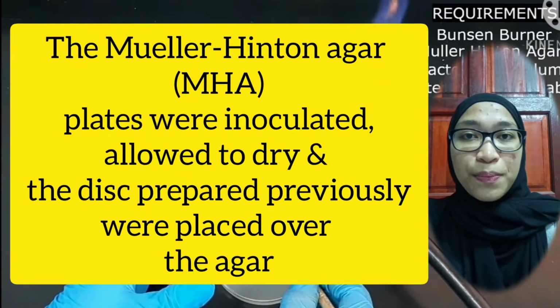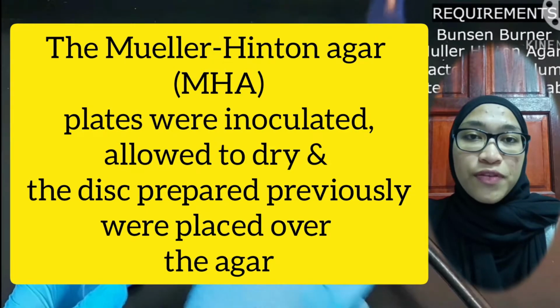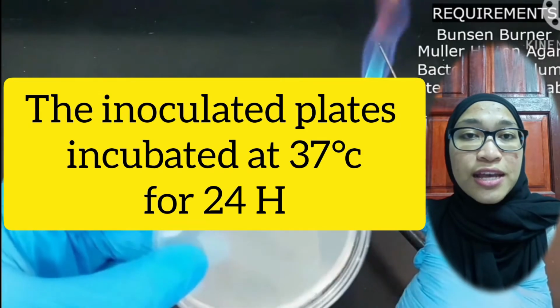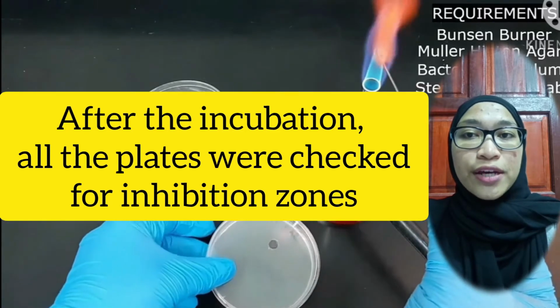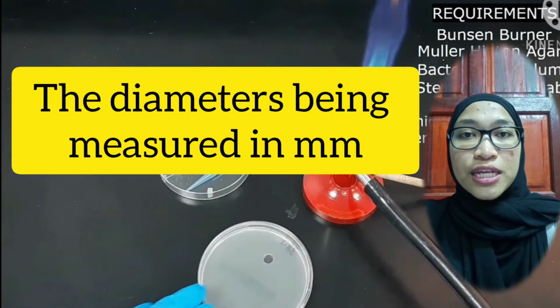The MHA plates were inoculated, allowed to dry, and the discs prepared previously were placed over the agar. The inoculated plates were incubated at 37 degrees Celsius for 24 hours. After the incubation, all the plates were checked for inhibition zones, with the diameters being measured in millimeters.